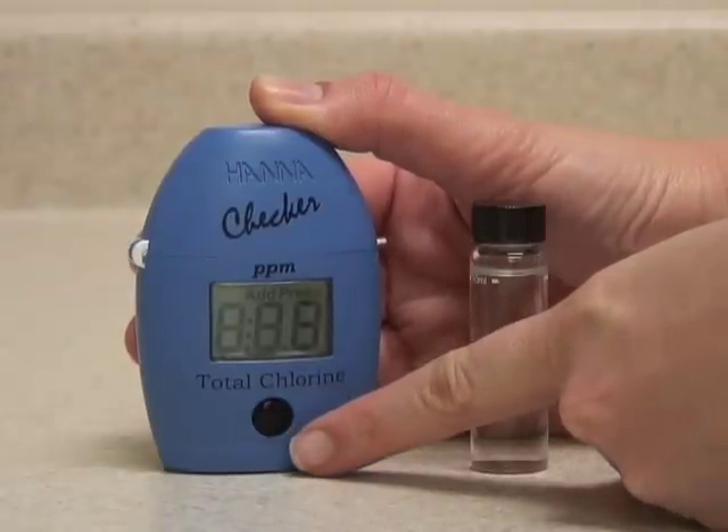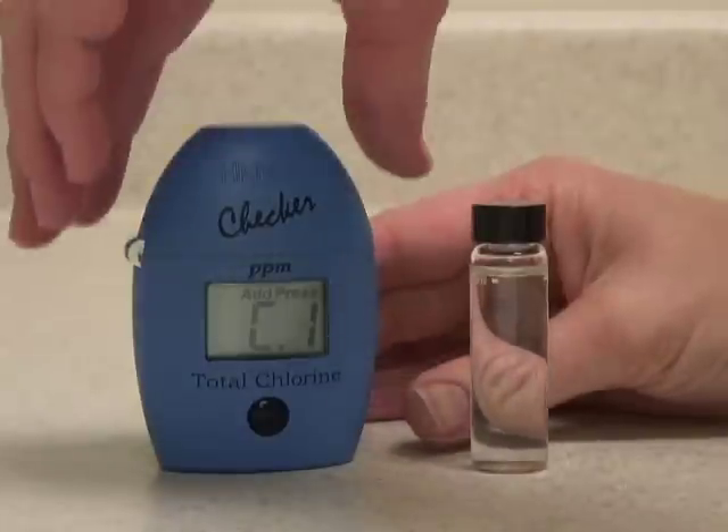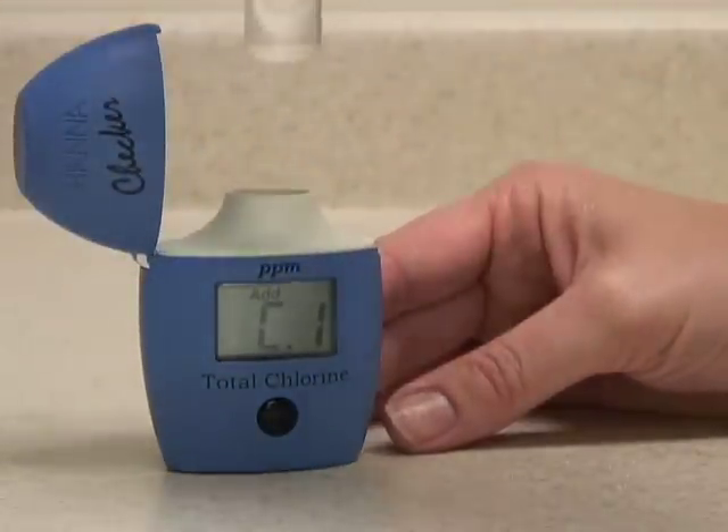Push the button once to turn it on. The meter displays C1, which is the prompt to insert a blank unreacted sample to be zeroed.